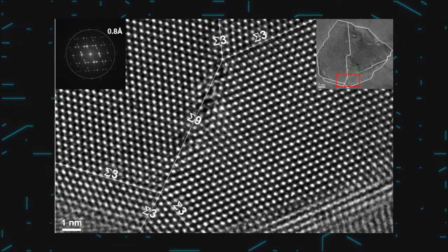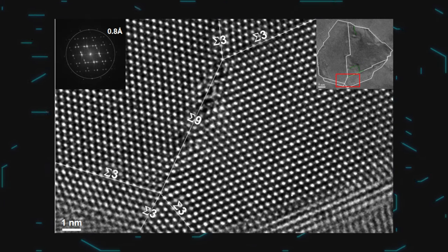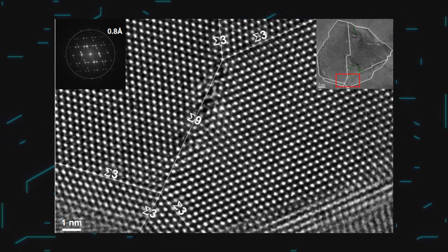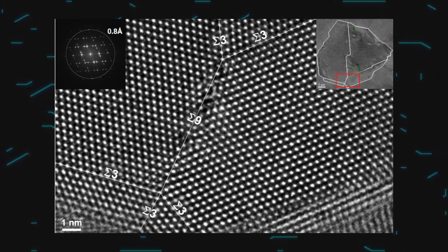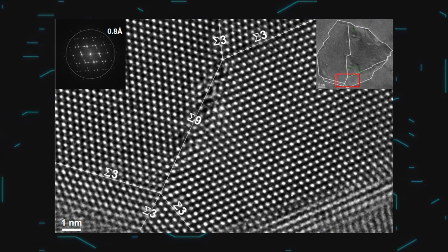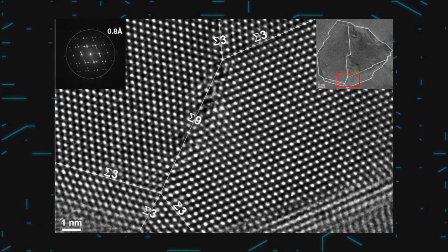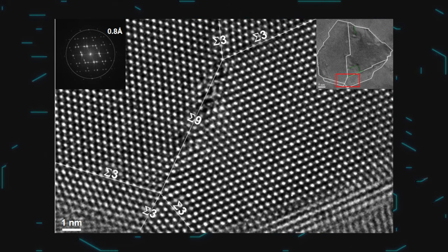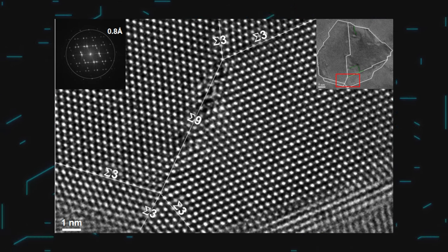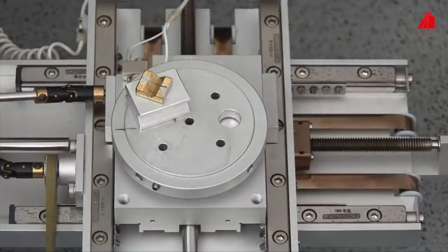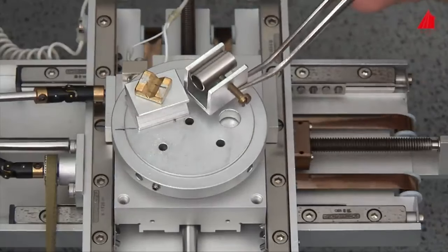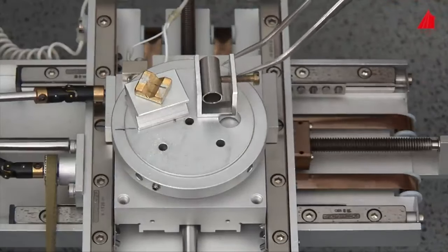Look — every dot here is a palladium atom. It's even visible how smooth the crystal lattice of the material is. Pay attention to the scale in the lower left corner: just one nanometer, and we can already see that now. Amazing! Now that we've figured out how an electron microscope works, it's time for an experiment.